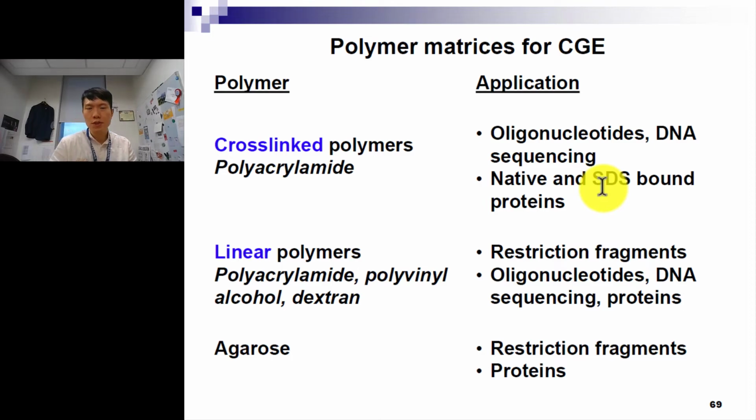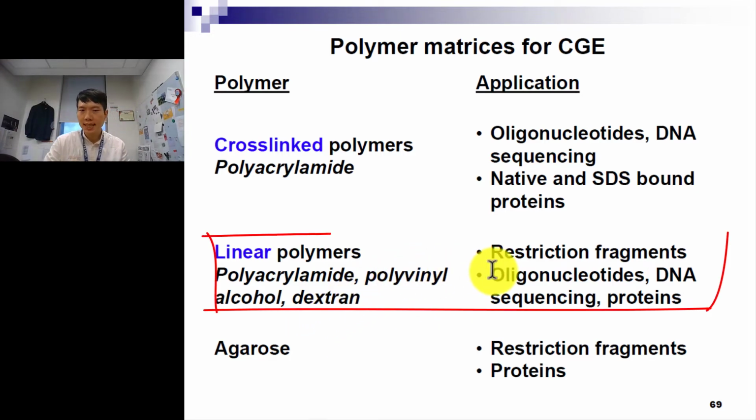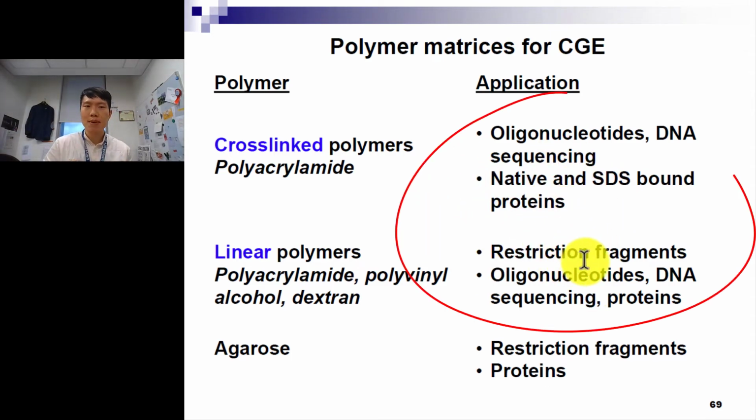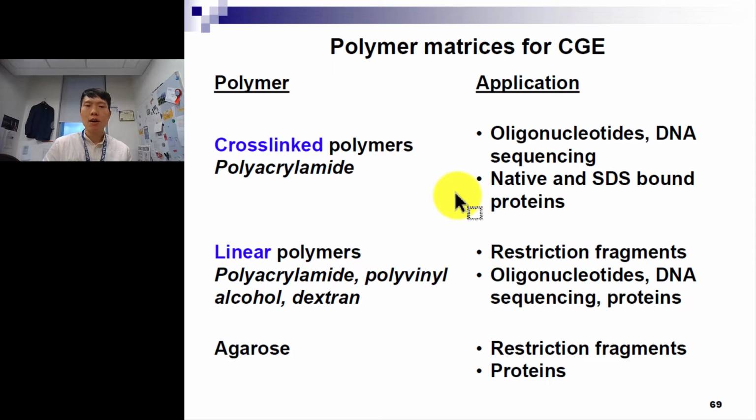For the polymer matrices of CGE, again we have different kinds of polymer. If we use cross-linked polymers like polyacrylamide, PAGE, these are specific applications. The analyte could be oligonucleotides, DNA sequencing, or native SDS-bound proteins. If you use a more linear polymer, like polyvinyl alcohol (PVA) or dextran, this applies to analysis of restriction fragments, oligonucleotides, DNA sequencing, and proteins. So you see there's some overlap between these applications. Again, you have to try and see, depending on the availability of the polymer, which CGE you can use. Now for agarose, it's primarily for restriction fragments and proteins.